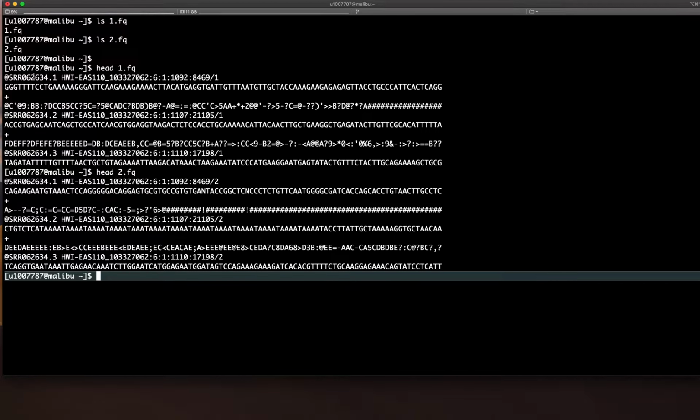Probably the most widely used aligner out there today is BWA-MEM for Illumina sequencing. It's really quite good. It's insanely fast. It gives really accurate alignments and has been tested over and over again.